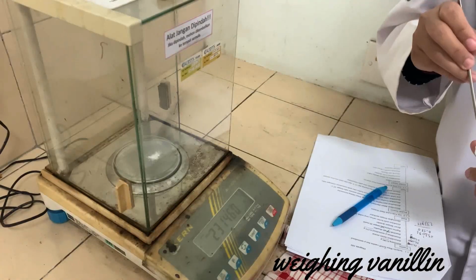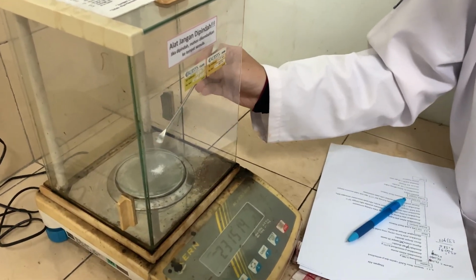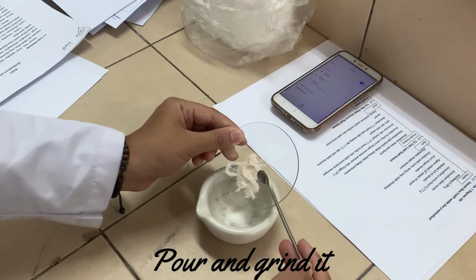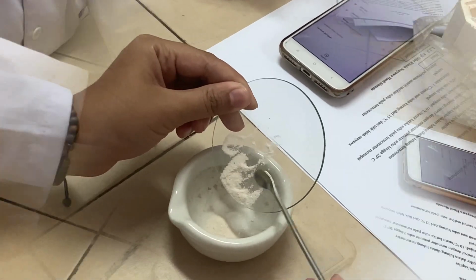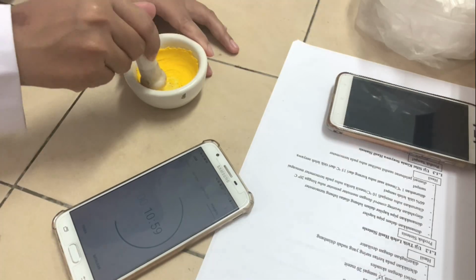The first step is weighing vanillin as much as 0.7608 grams and p-aminophenol 0.5457 grams, and then put in a mortar. Carry out undirectional grinding for 20 minutes. Pause every 5 minutes until yellow powder is formed.